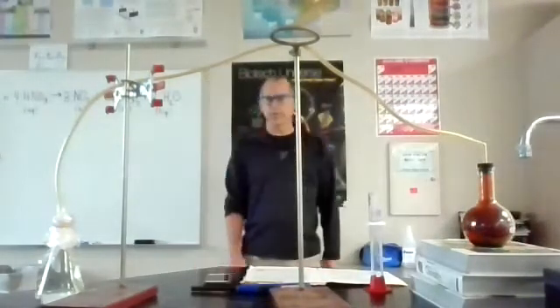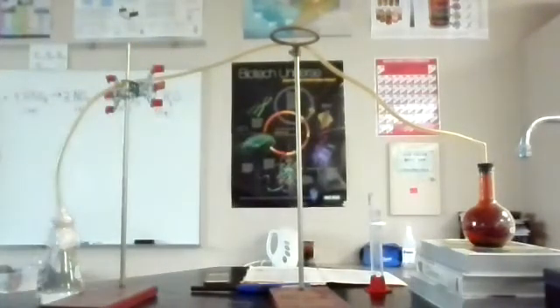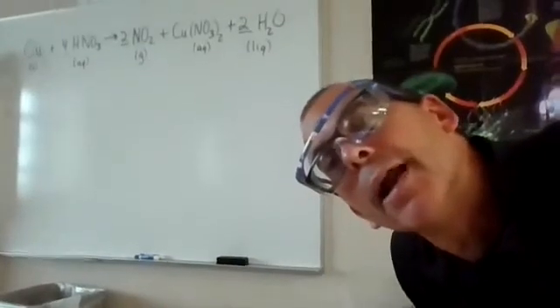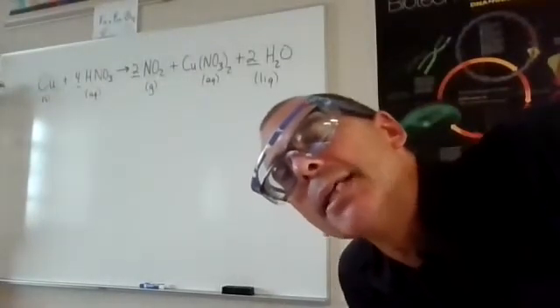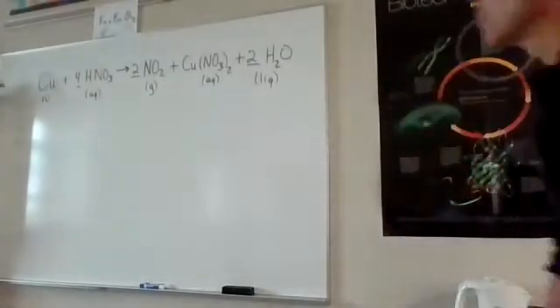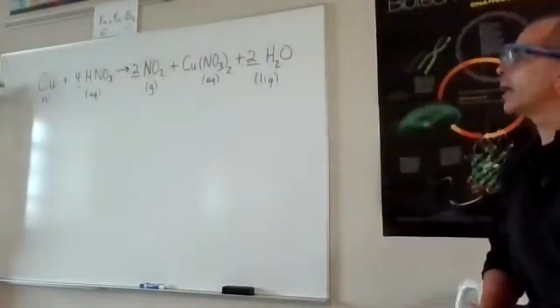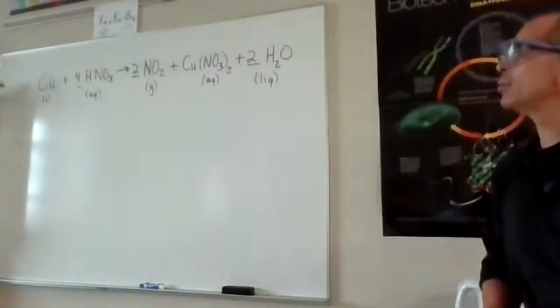And we can look at this reaction. I think I'm going to move this computer over to right here. And you have this equation on page 9 in your homework packet. We'll see how that goes. I don't know if you can see that very well or not, but I'm taking copper and combining it with HNO3, which is nitric acid, a strong acid. And this NO2 gas is nitrogen dioxide gas. That's that reddish amber hue that you see.